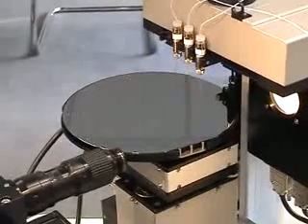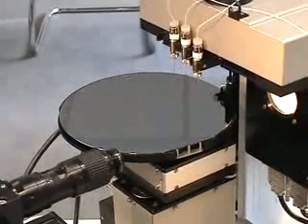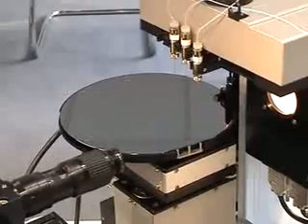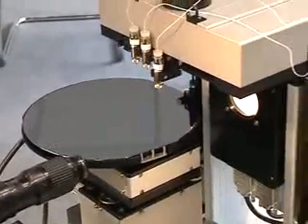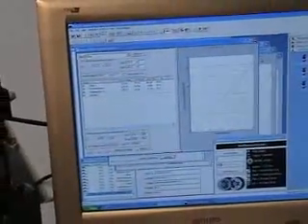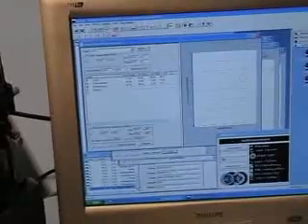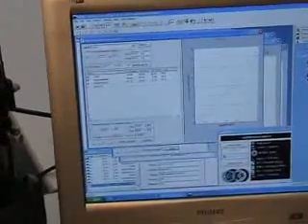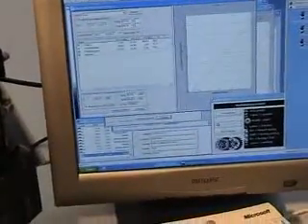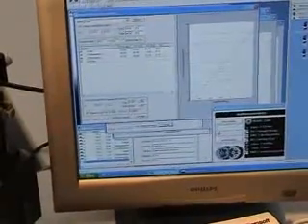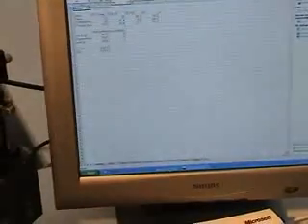The measurement will become completed very soon. Meanwhile, more windows have been opened and already transferred with the result to Excel. We can have a look into the result windows at Excel and see the results which can be stored easily on our hard disk.